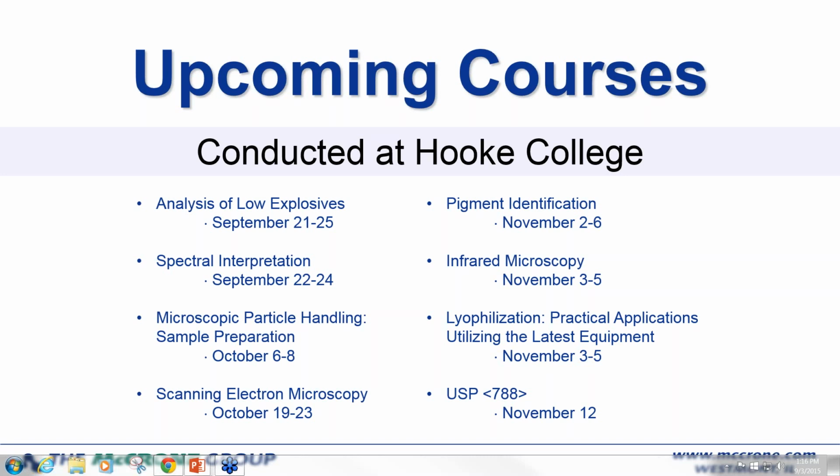Okay, question from Seema. Can ATR be used for quantitative applications? How do you compare it to KBr techniques for the purpose? IR, of course, is not generally the best for quantitative purposes unless you're using something like a fixed path length cell like you would with some liquids. It can be good for some mixtures, in comparing two components that are part of a mixture.